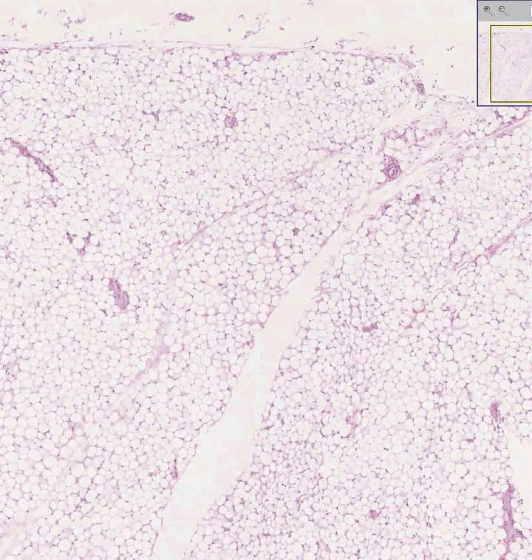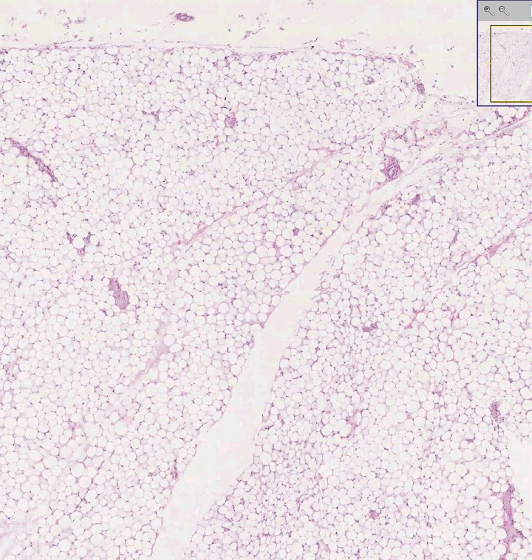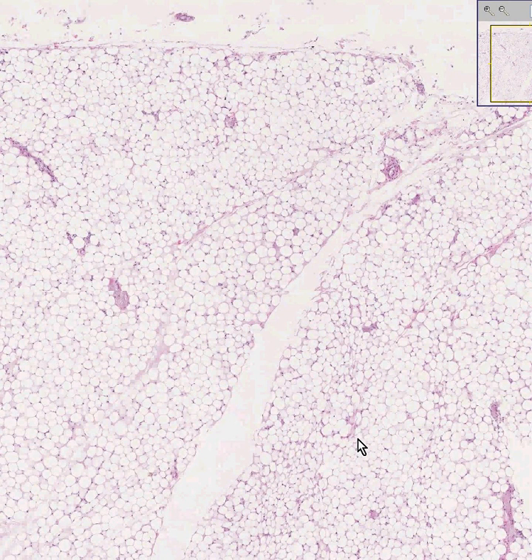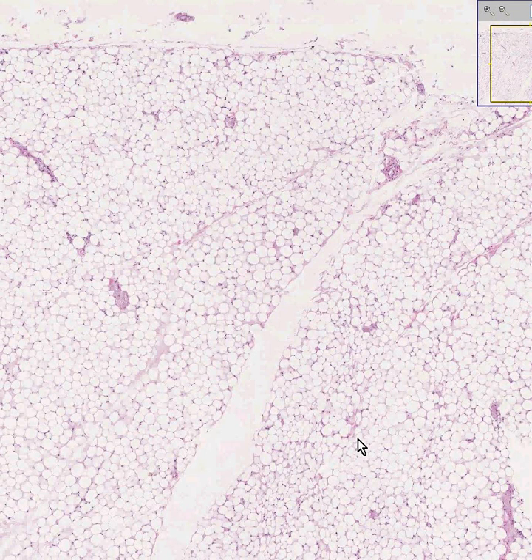Adipose tissue is the most common, or one of the most common, types of tissue in the body. It's fat, it's yellow, and it always looks like this. This is what you call unilocular or mature adult adipose tissue.